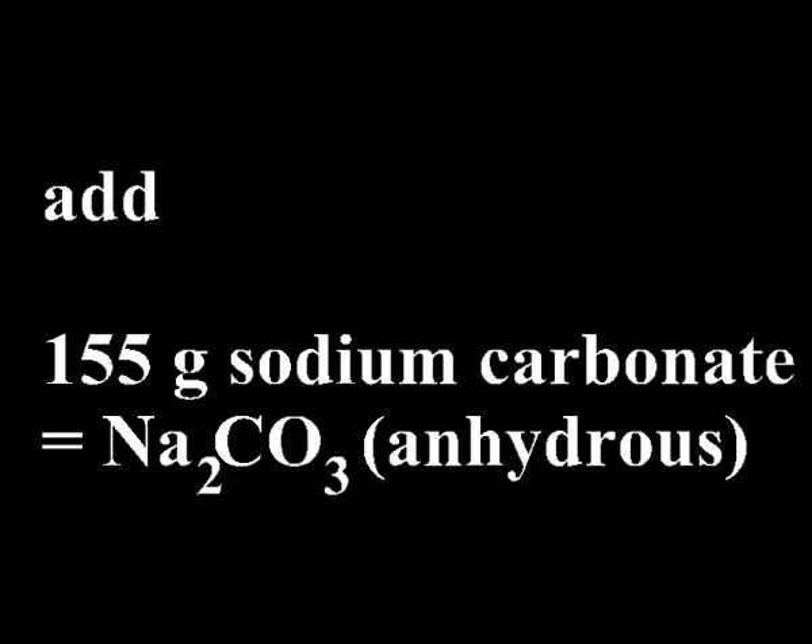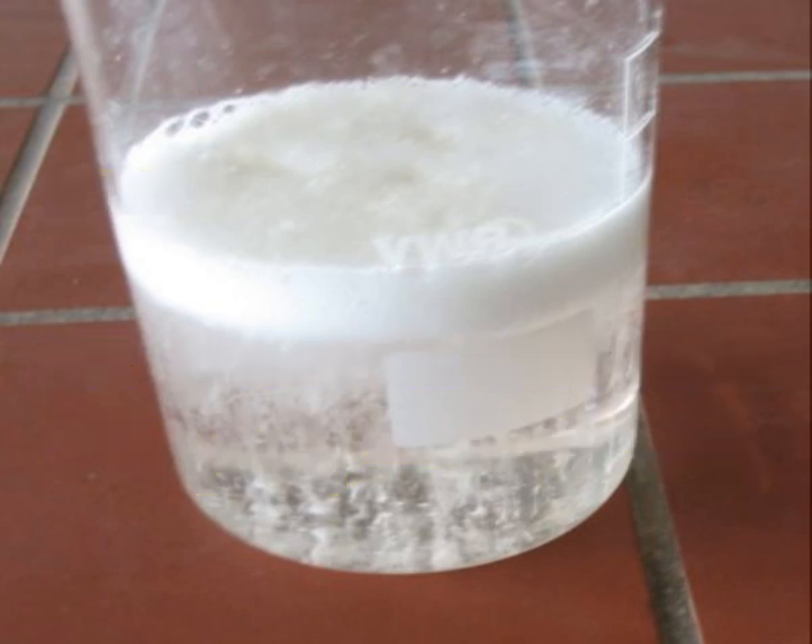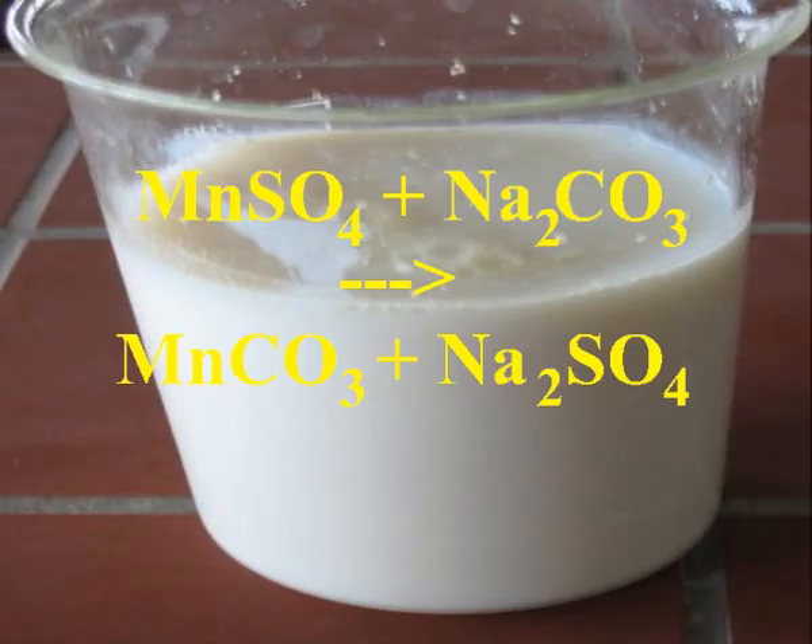Add 155 grams of sodium carbonate slowly under stirring to the filtrate. Make sure that it completely dissolves. First some carbon dioxide is evolved, then you will get a white to beige precipitate of fairly pure manganese carbonate.